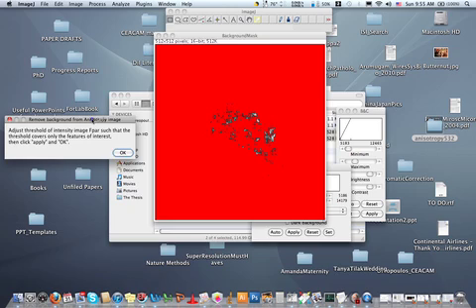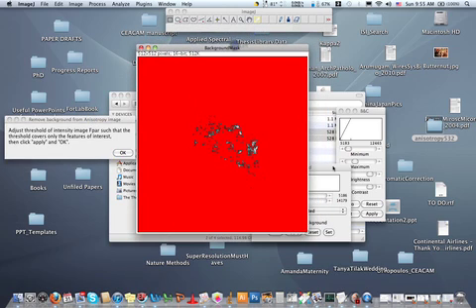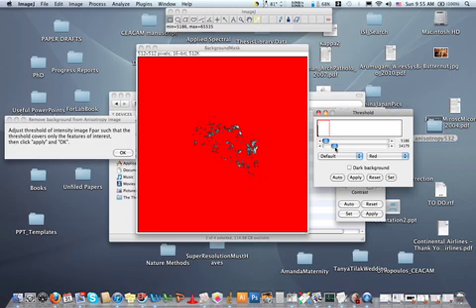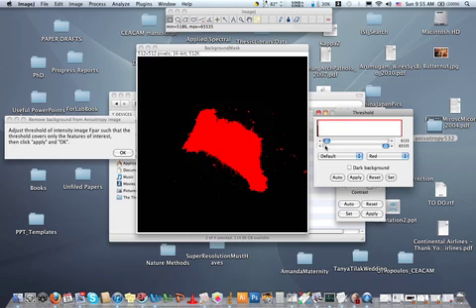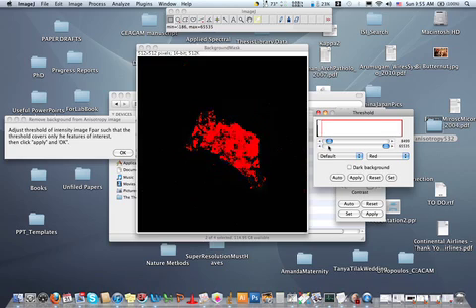First thing we've got to do is isolate the part of the image that actually is a cell. So what I'm going to do, there you can see it again, if I pull the threshold down, I basically want the red area to just cover the cell. Now obviously this would be too much, or because I've clearly got background area, this would be too little. So somewhere about here. Now this is a bit arbitrary, right? There is a human element in this. If anybody wants to automate this, please go ahead.